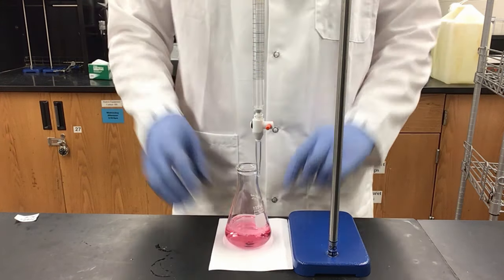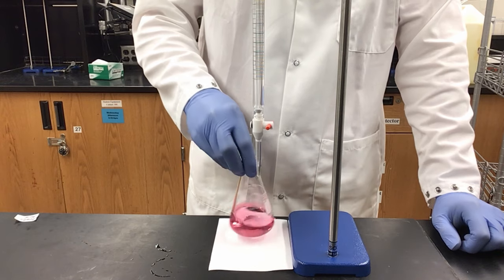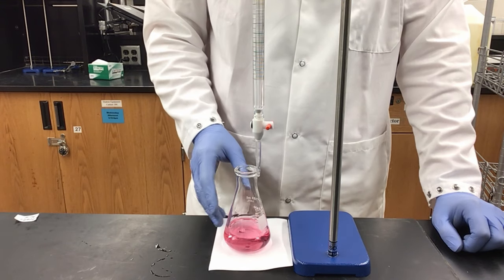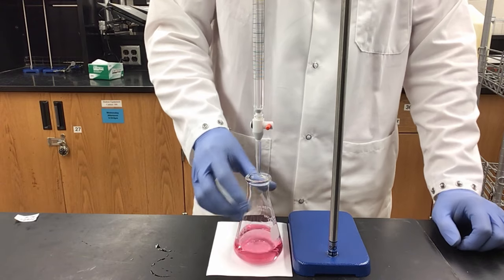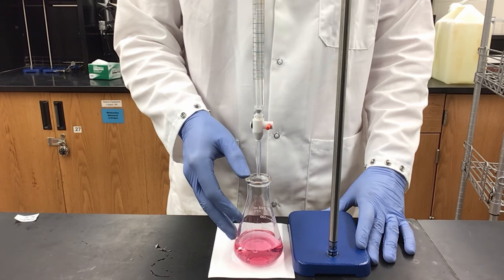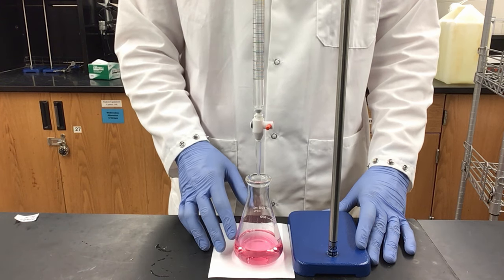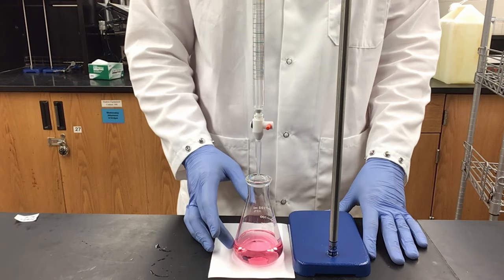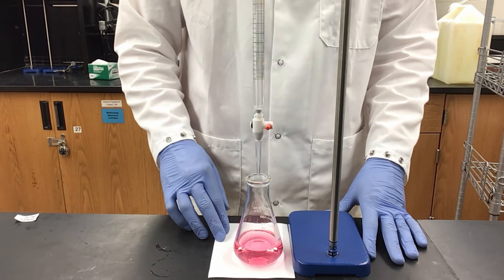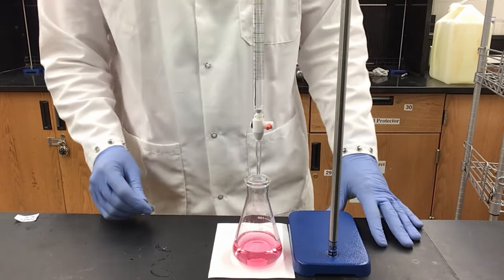Now I can add my thymol blue indicator. The solution is a pink color — we expect this because our pH is lower than it was with benzoic acid, so the indicator is still functioning properly. With the amount of oxalic acid added, I've calculated that I have about 0.002 moles of acid in my flask. Since it is a diprotic acid, I'm expecting to use double the amount of base, so I should need about 40 milliliters of sodium hydroxide.